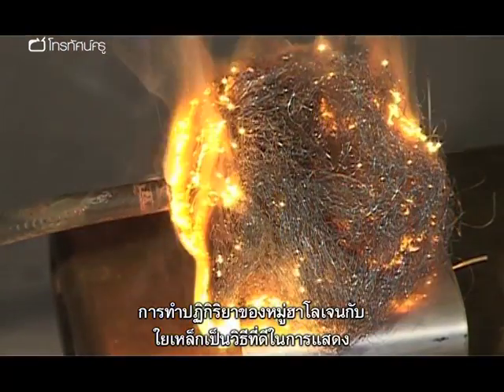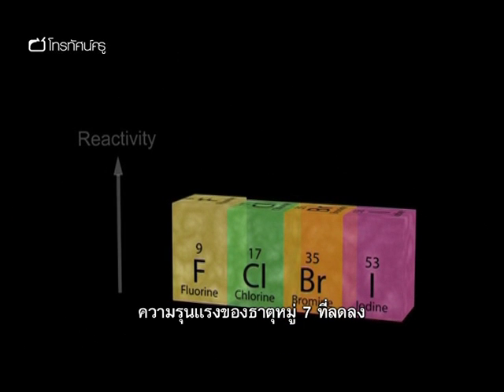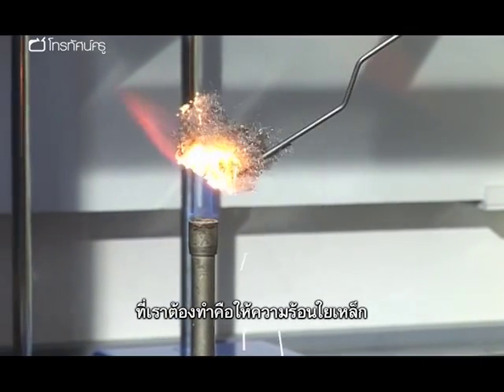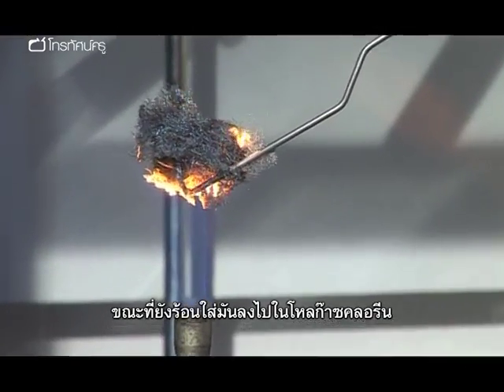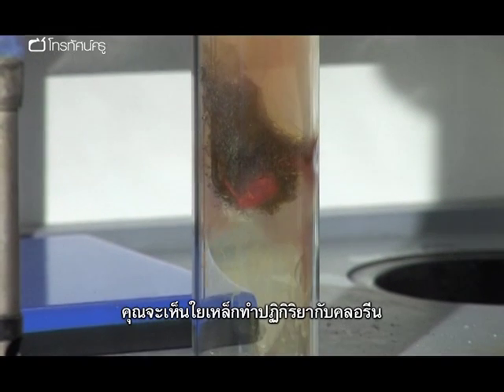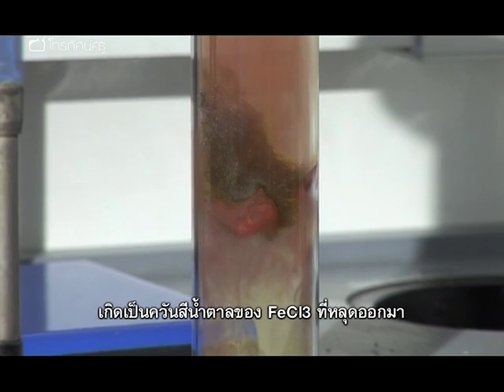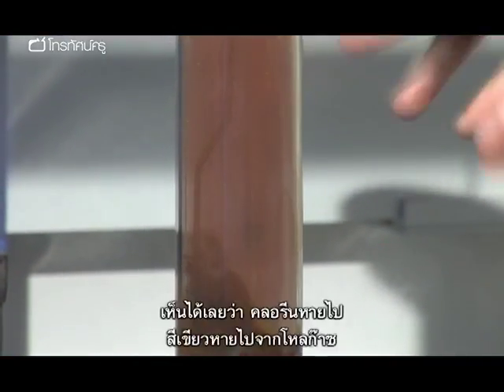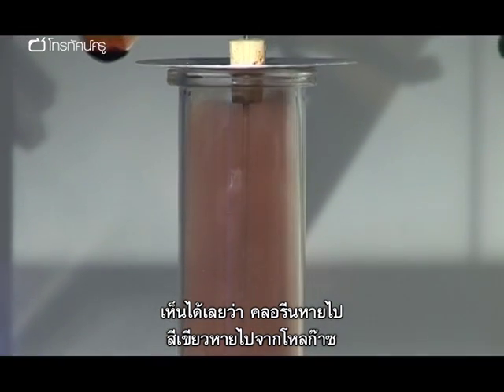Reacting the halogens with iron wool is an excellent way of showing that the reactivity of group 7 decreases down the group. What you can do is heat up the iron wool and drop it while it's hot into the gas jar of chlorine. And there you can see the iron wool reacting with the chlorine. They're the brown fumes of the iron 3 chloride. Fantastic, you can really see it reacting, can't you? Yeah, and then you can see that the chlorine's disappeared, the green colour's gone out of the gas jar.